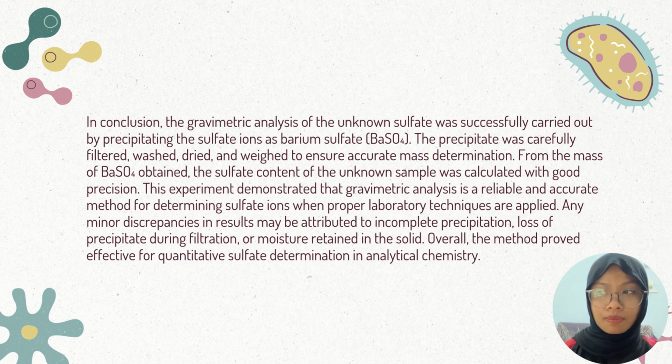Any minor discrepancies in results may be attributed to incomplete precipitation, loss of precipitate during filtration, or moisture retained in the solid. Overall, the method proved effective for quantitative sulfate determination in analytical chemistry.